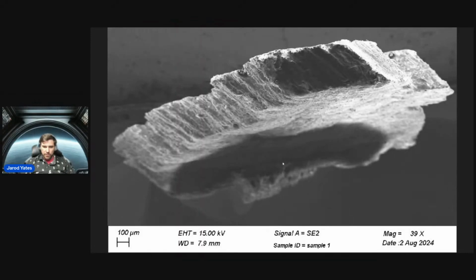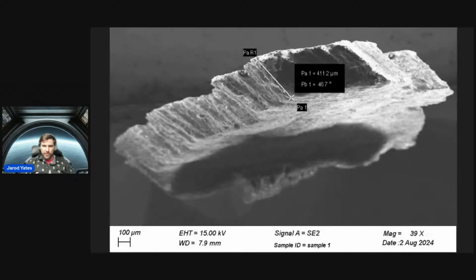You can see the glue at the back. We're at about mid brightness still, at about 15 kV. We're not very zoomed in. We're going to zoom in, though, on this really interesting spot here. There's a couple interesting spots on the tip here, right? But we're going to zoom in right here. See, it's about 0.4 millimeters, 400 microns thick at the skinniest edge there.